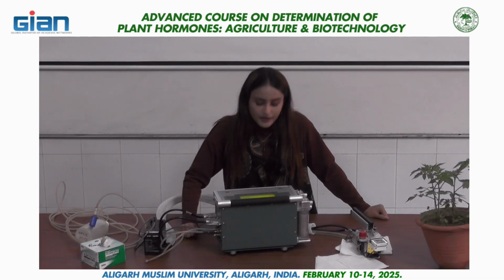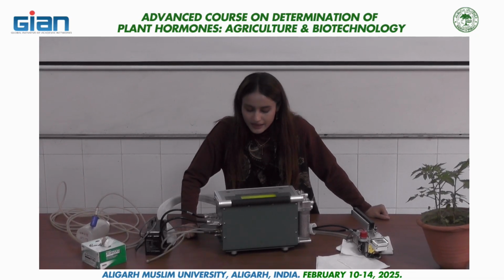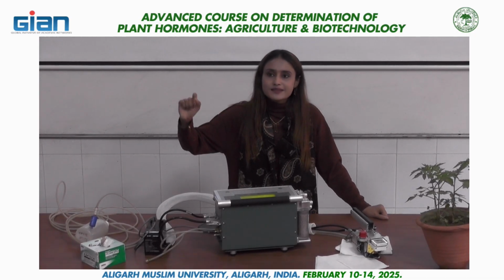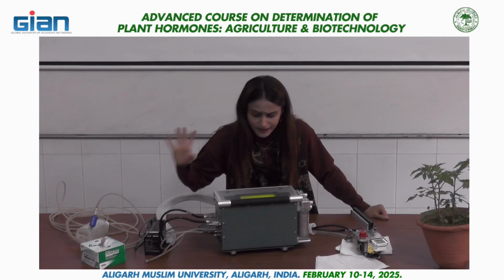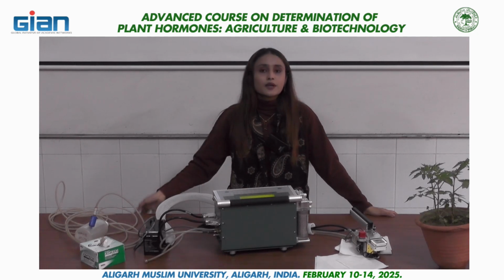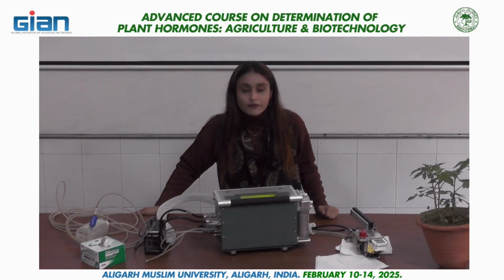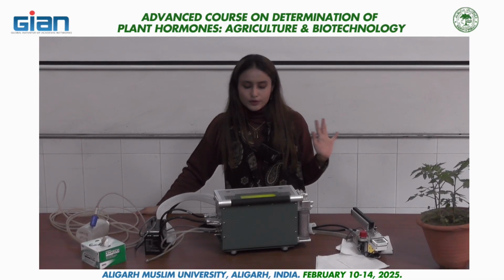The readings coming here are photosynthesis, CI is internal CO2 concentration, TR millimole, that stands for transpiration, then relative humidity and all those parameters, you don't need them. So yeah, now the reading is positive. Basically you can see any one of the readings. As I am seeing the photosynthetic reading, now it became positive. So we are ready to use it.